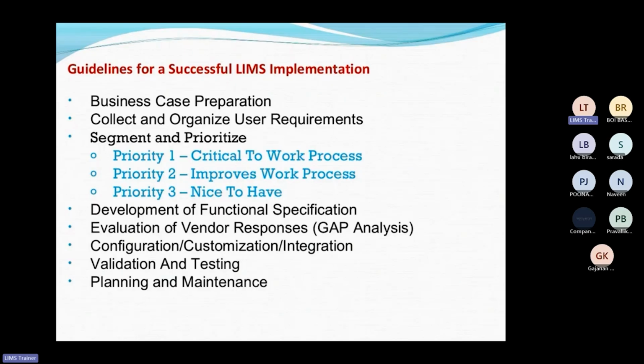My point is, whenever the end user logs into the system, suppose he wants to weigh a sample, he enters his login credentials into the software. He selects the integrated balance, and then he weighs the sample. As and when he clicks to take the printout of that weighing balance, all the data will be recorded, including the time and the user, directly into the software.